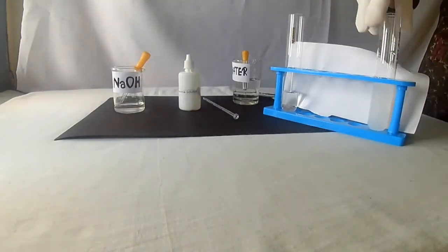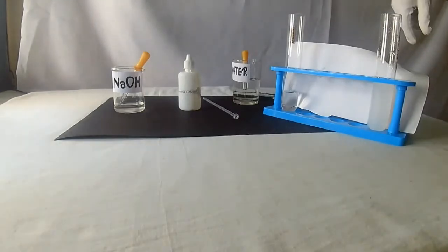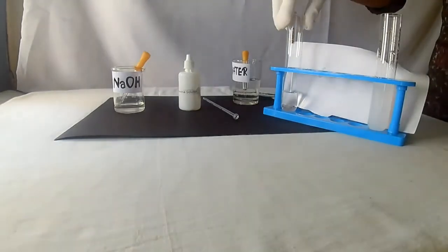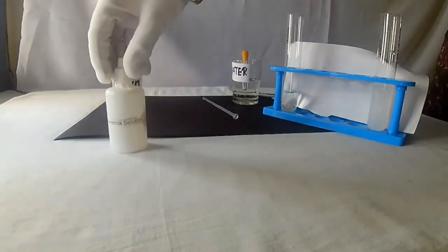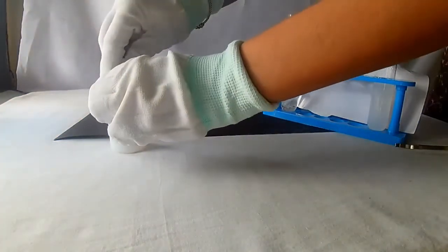Now keep the test tube aside for a while. Take the other part of the solution to perform ammonium hydroxide test.